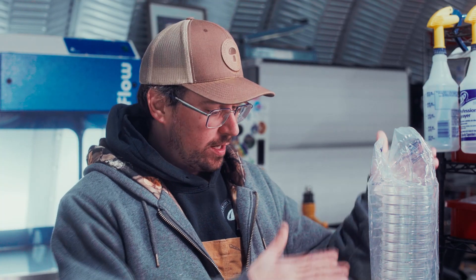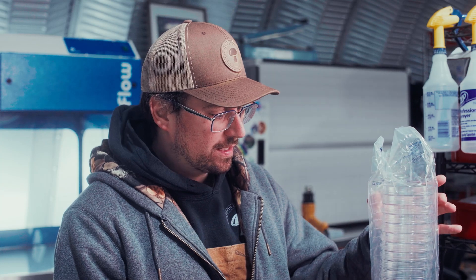Some cons of using a plastic dish: they're going to be a lot more fragile. Especially when you're just learning, be mindful that these dishes can crack pretty easily. Also, during shipping, when you receive your petri dishes, make sure they're not cracked or damaged, because when you pour your plates it can create a big mess. Compared to heavy-duty vintage glass ones, plastic dishes are going to be a little more flimsy.